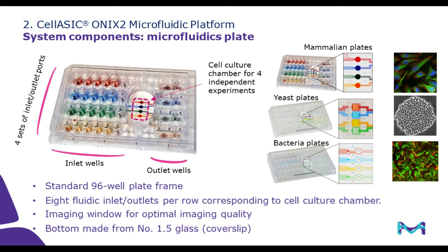But no matter what plate type it is, they all have a standard 96 well plate frame. There are 4 units on each plate so that you can use one as a control and do 3 other treatments as the experiment groups. There are 6 upstream reservoirs, and the bottom is cover slip glass that is compatible with most of the inverted microscopes.